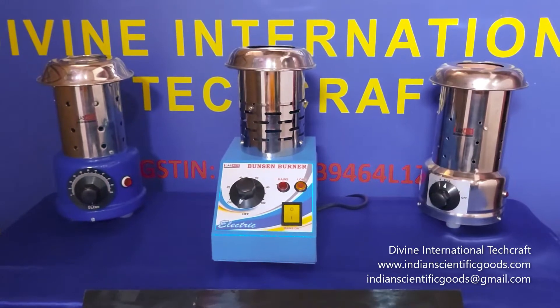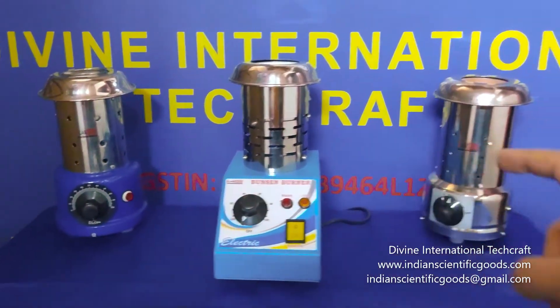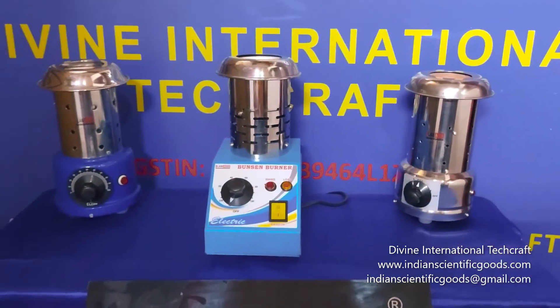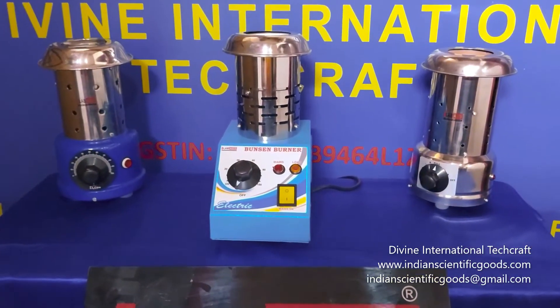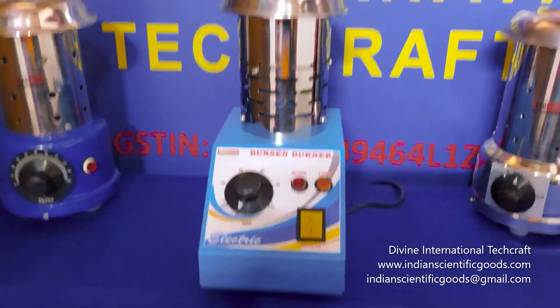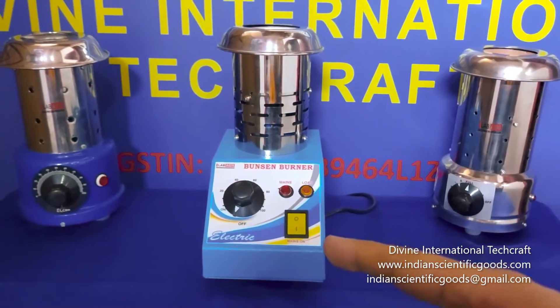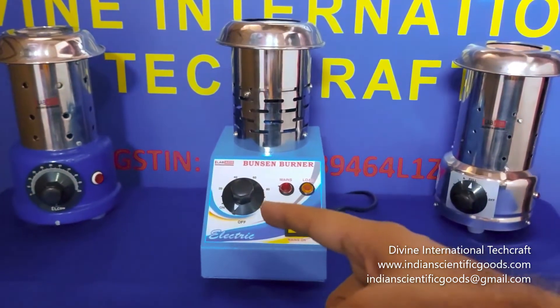In our previous video, we introduced two round body electric Bunsen burners. Today, we introduce a similar flameless and no gas electric Bunsen burner that has a rectangular and tapered base body that houses the energy regulator and the mains controls.